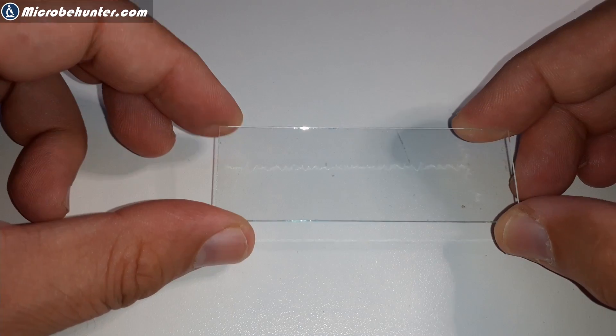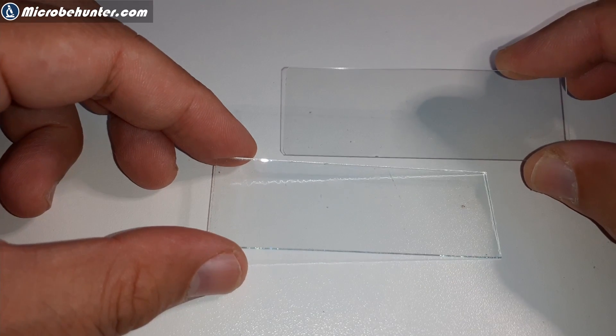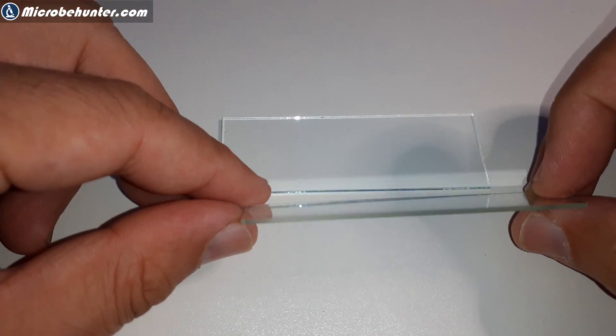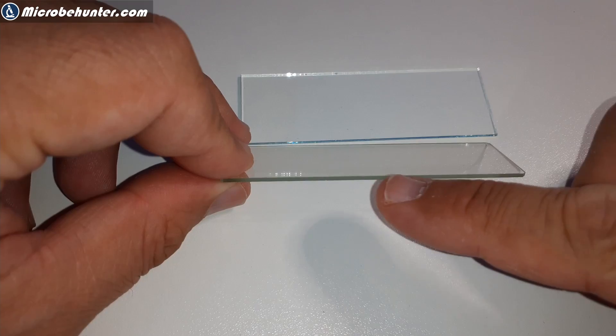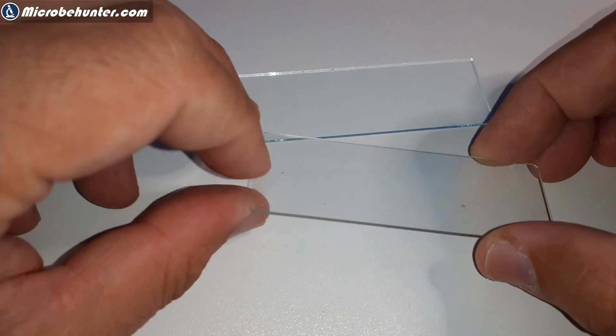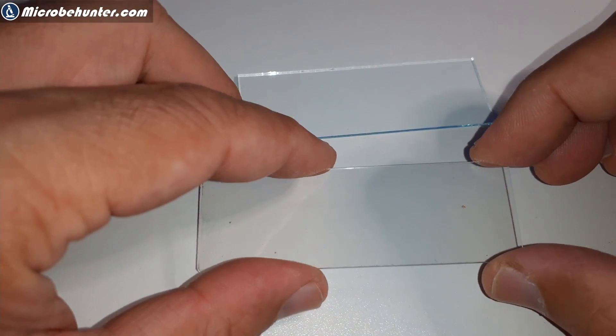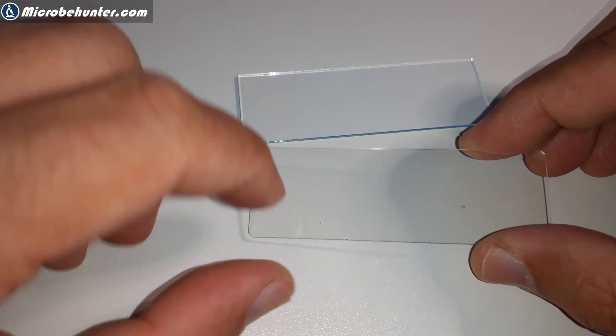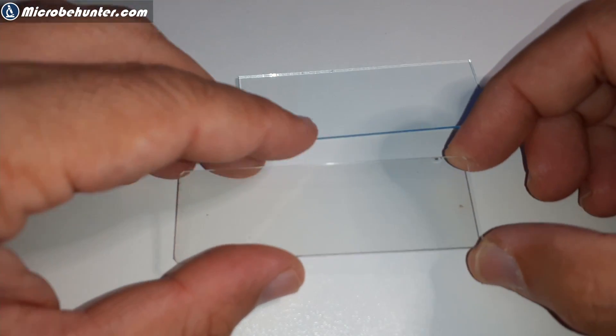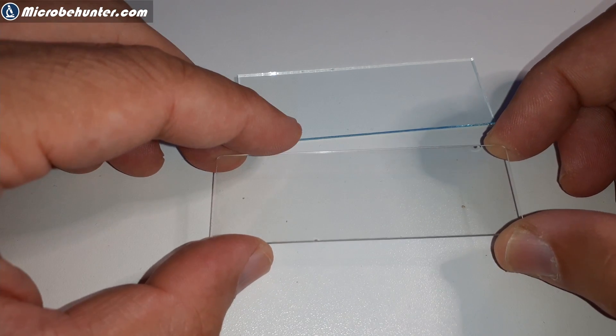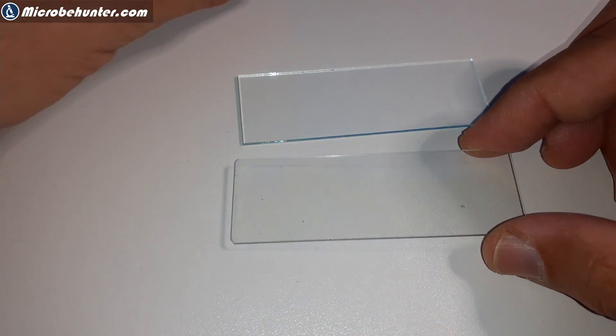There are also other microscope slides of slightly higher quality. If you look at them from the side, you're going to see that the edges are so-called ground edges. They're not quite as shiny and look a little bit smoother, and you can't injure yourself as much, so it's actually a security feature. Look carefully at the corners—they are 45 degrees, so even the corners are rounded off a little bit. They do this because in the medical field there's a danger of injuring yourself, which can be a cause for infection, so some microscope slides are of slightly higher quality.